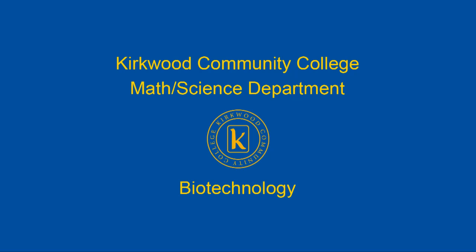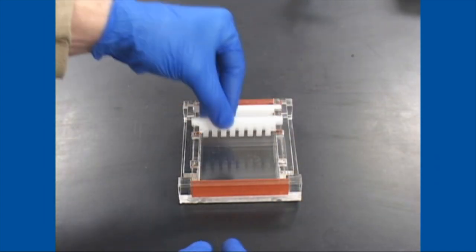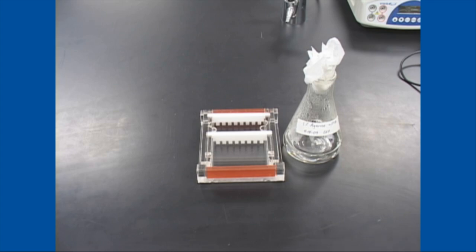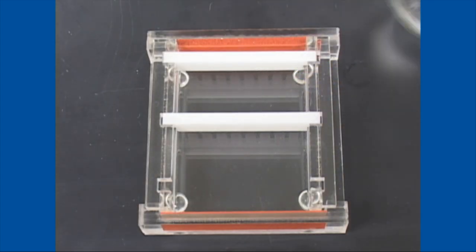The purpose of this video is to point out concerns when loading samples for horizontal DNA electrophoresis. The first thing to be concerned about is the preparation of your DNA sample. You'll want to dilute your DNA sample into a loading buffer.